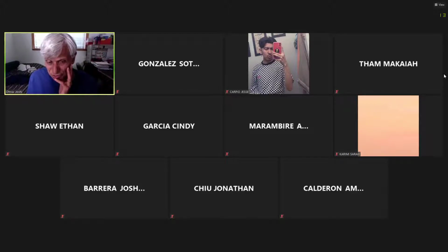After the color change happened. So you understand the color change? Color change happened, and then the student went on going by mistake, which I have done too.